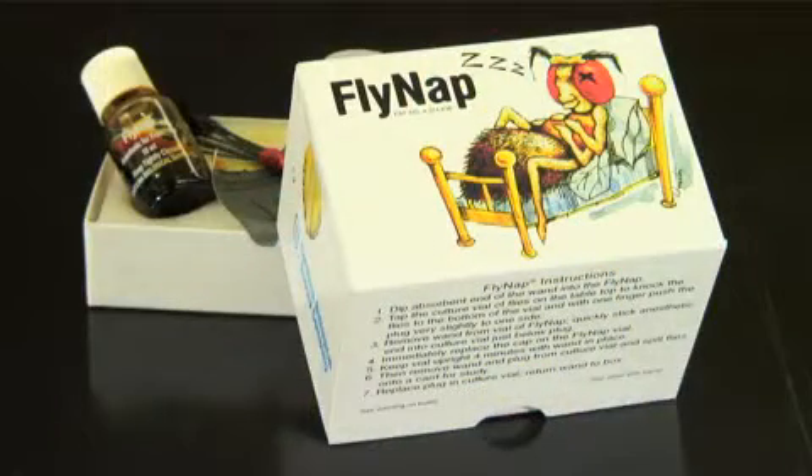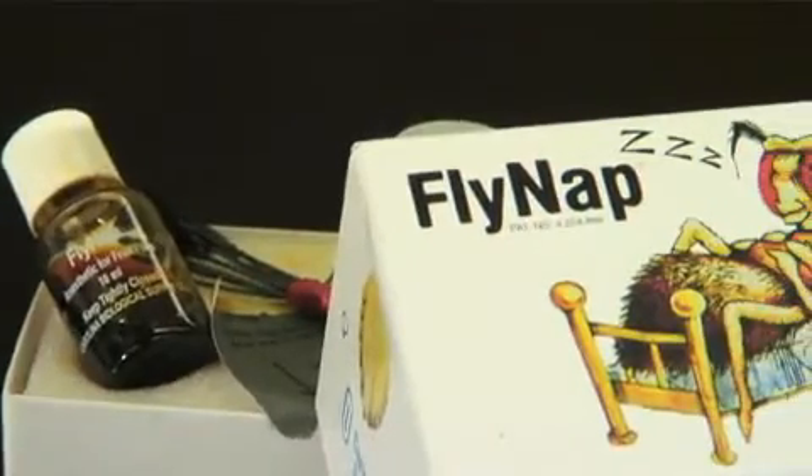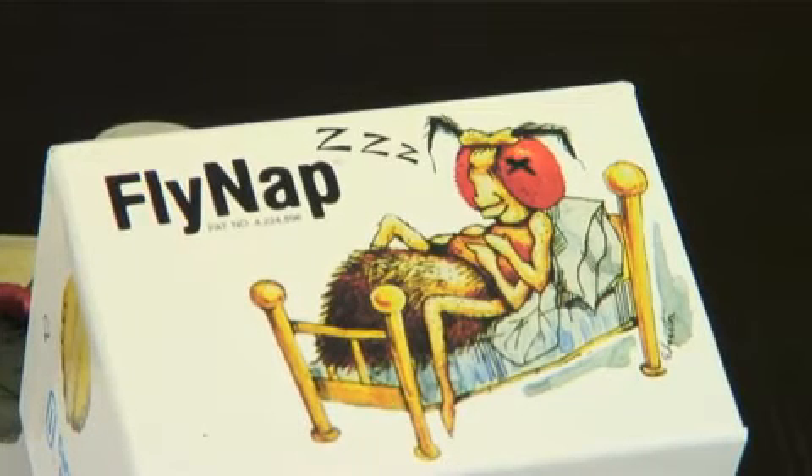Our FlyNap anesthetic is an easy-to-use, safe, effective, and inexpensive way to anesthetize flies. It is not explosive like ether, and a single exposure to FlyNap safely anesthetizes young Drosophila for 50 minutes to several hours.